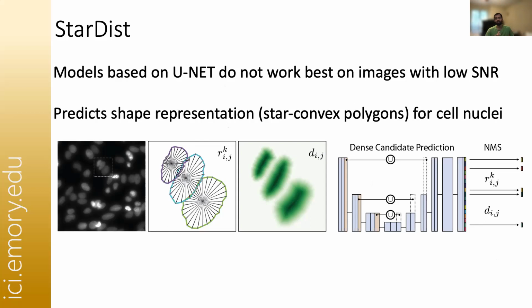So unlike what we have used before, which is a threshold-based method, you are not doing any kind of thresholding. It's based on complex math that they have figured out earlier. You are simply using this model to know whether the objects that you have fit into the model that somebody has made, and you can get going with this. However, because StarDist is based on star-convex polygons, you cannot use it to detect shapes that do not fit this polygonal criteria. If you have a shape with protrusions like filopodia and so on, StarDist cannot work really well on that.